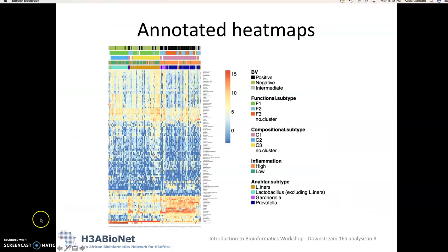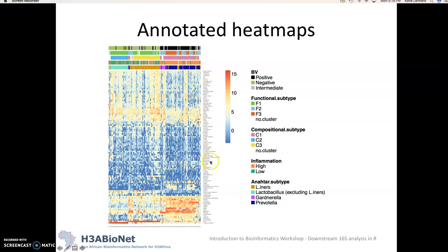So here's an example of a heat map I generated for a study I was working on and at the bottom we've got our samples and on the side here we've got our OTUs or taxa and what's really useful is that we have got for each sample we've got labels here at the top that are specific factors of interest.